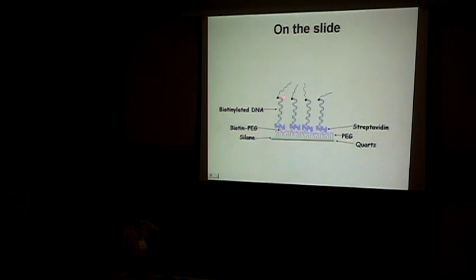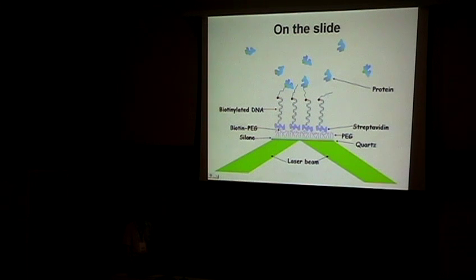And the DNA carries the red acceptor molecule at the partial duplex junction. And then finally, we add the helicase and ATP in solution, and we take movies of the same sample using TIRF microscopy. This is nice because of the rapid decay of the excitation field over maybe a 100 nanometer length scale, so that many of the protein molecules in bulk solution do not contribute background signal to our measurement.